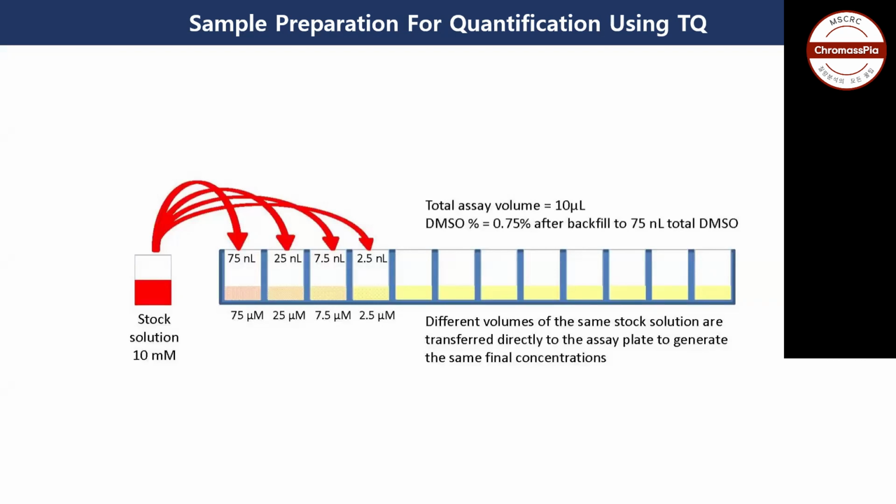Okay. Now we have to select concentration A always and the zero concentration in the concentration value, right? Actually, we don't go into more detail because it depends upon your analysis, but we don't do 0 or 1 or something, because whether the concentration was 0 or whether it was a blank that we selected first or something else, that we do in the LC analysis sequence.